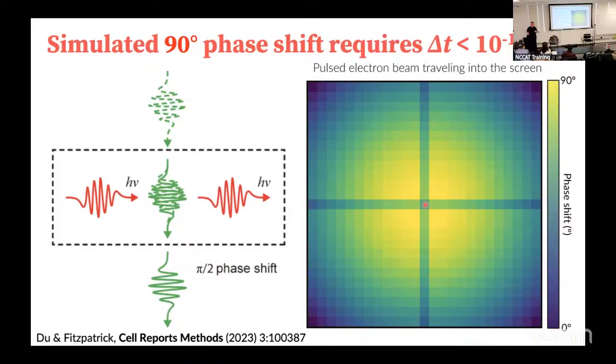One other thing that Daniel noticed was that when your electron beam is coming down and you're hitting it with the photon from the side, from 90 degrees, that kick is not circularly symmetric. It's basically a linear kick. You don't want the electromagnetic field generated by the laser, which is manipulating your phase, to be in just one direction.